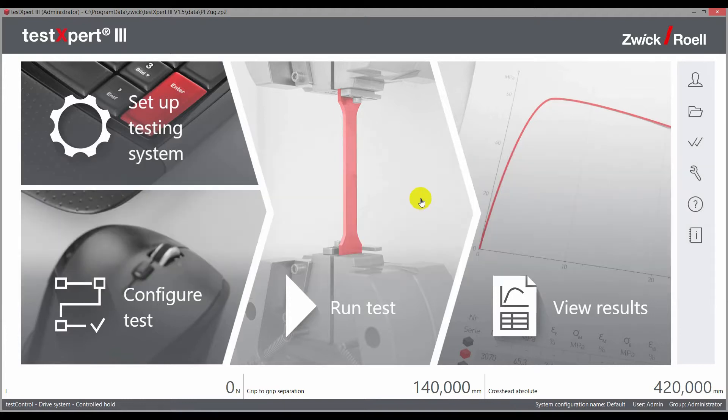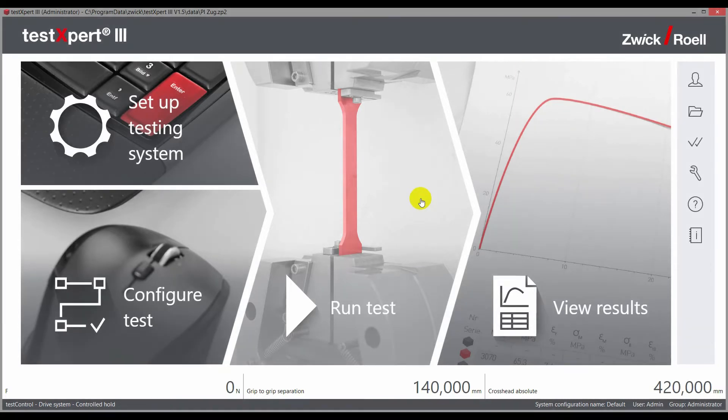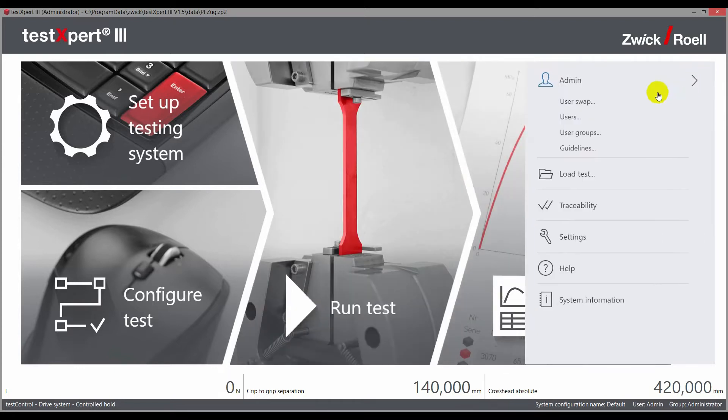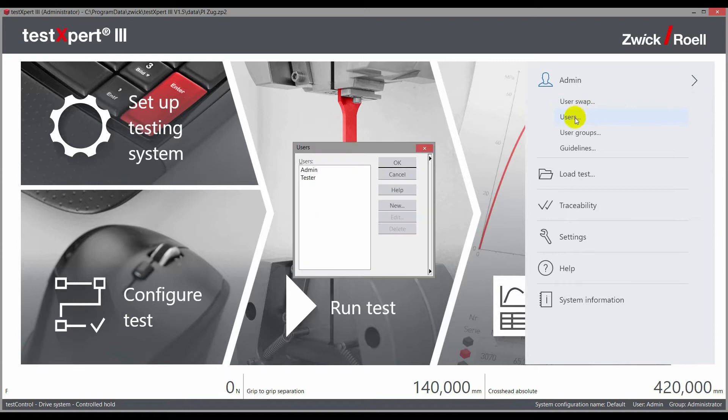The Traceability option answers the questions: when does who do what, why, and who is responsible. The Traceability feature can be activated and installed from the TestExpert 3 home screen.